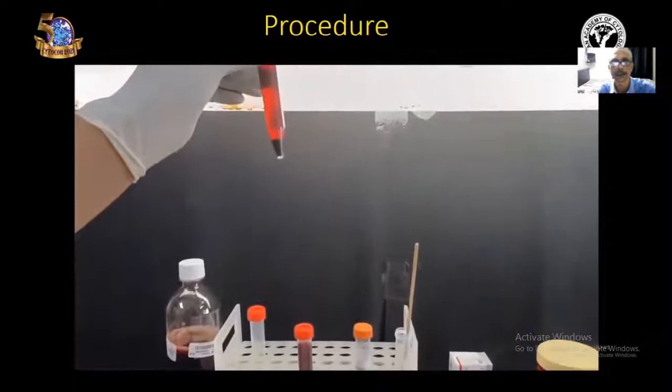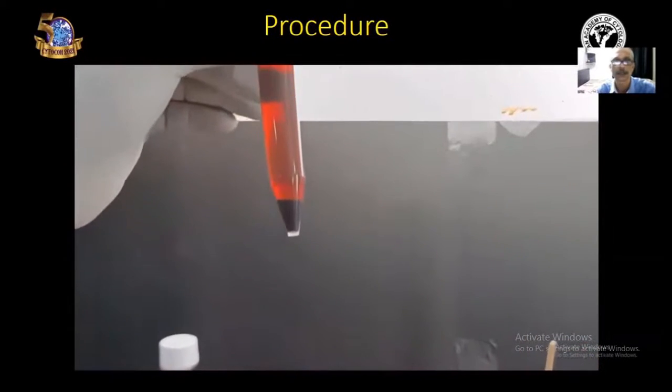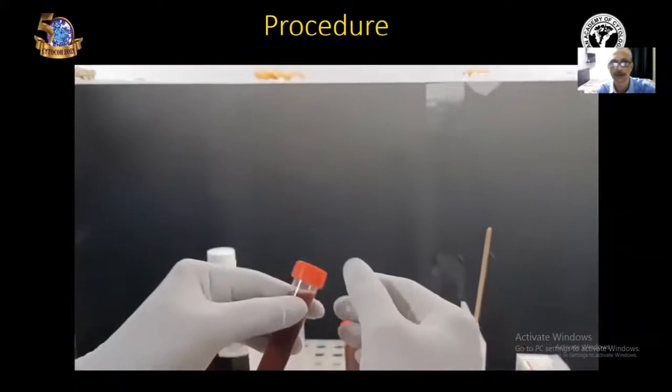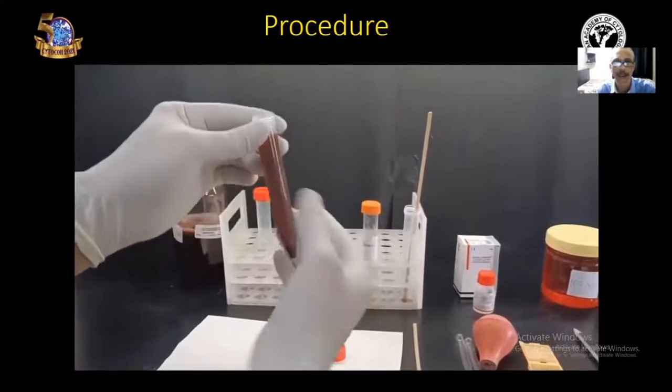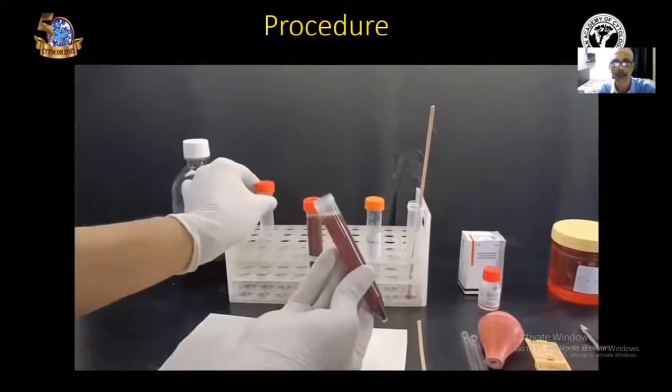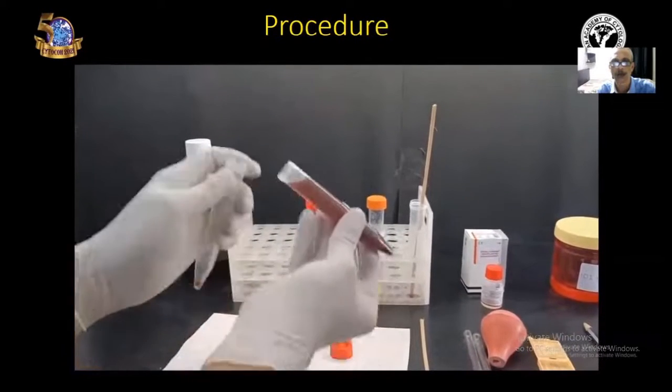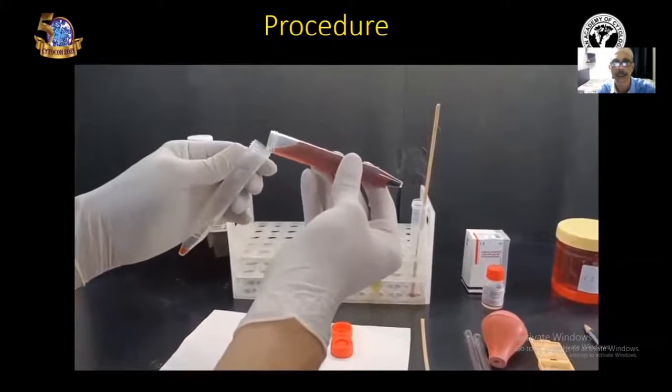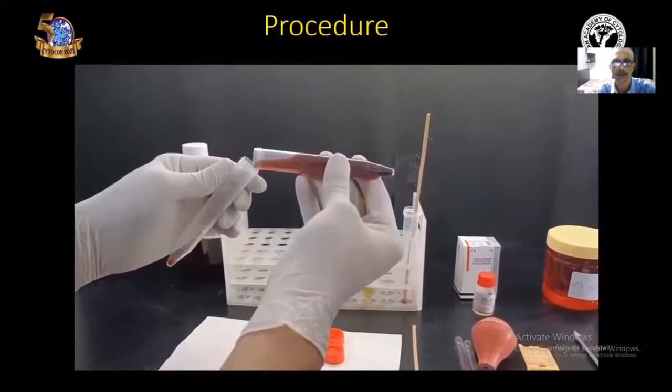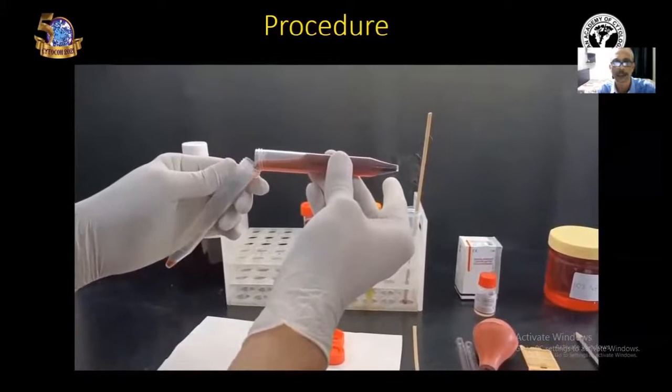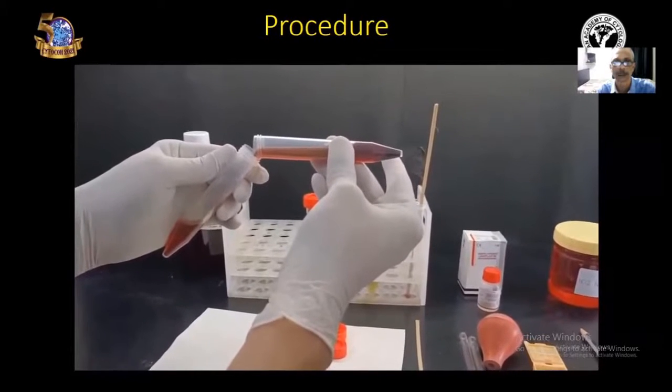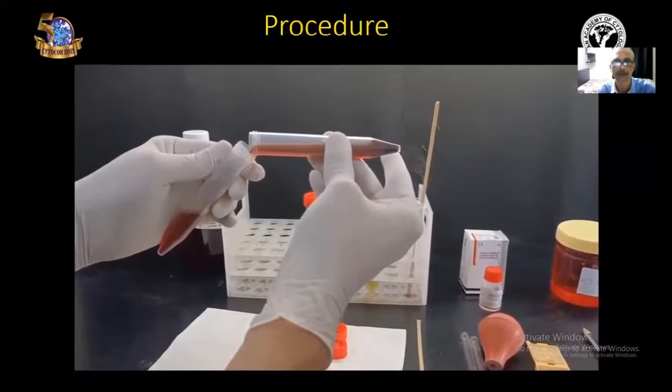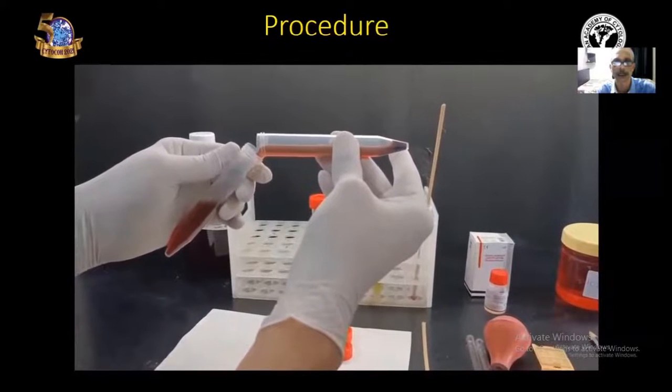Now, the next step is separating the sediment from the supernatant. We have to open the tube and take a new test tube, and slowly decant the supernatant very carefully without interrupting the sediment at the bottom. Care has to be taken that the sediment is not disrupted while transferring the supernatant.